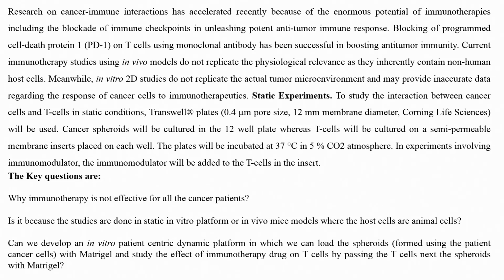So, what to do now? Static experiment. Let us see how static experiments are done. We have just discussed. Let us see here. To study the interaction between cancer cells and T cells in static condition, transwell plates, you see transwell plates, 0.4 micron pore size, 12 millimeter diameter from Corning Life Sciences can be used, right.